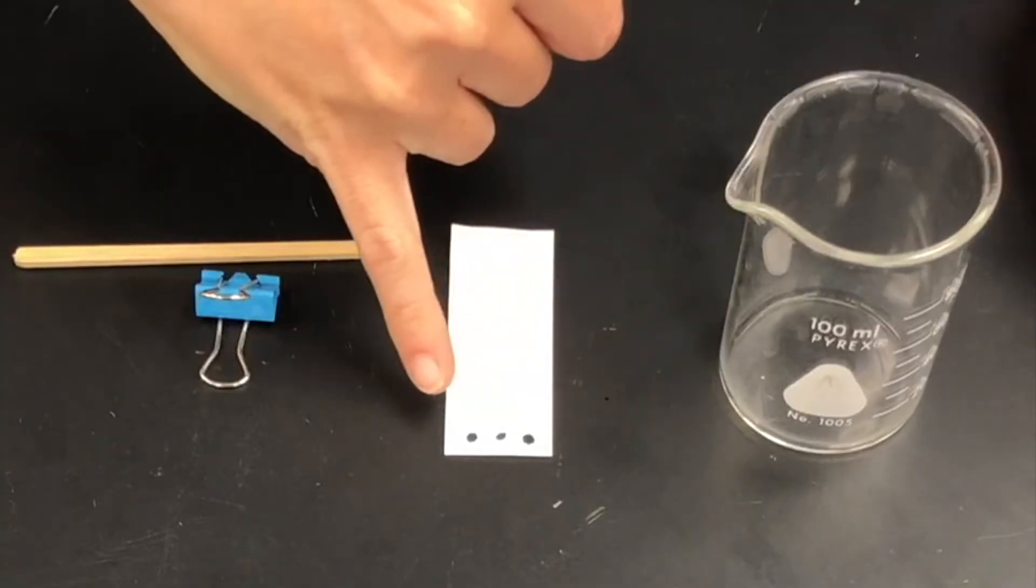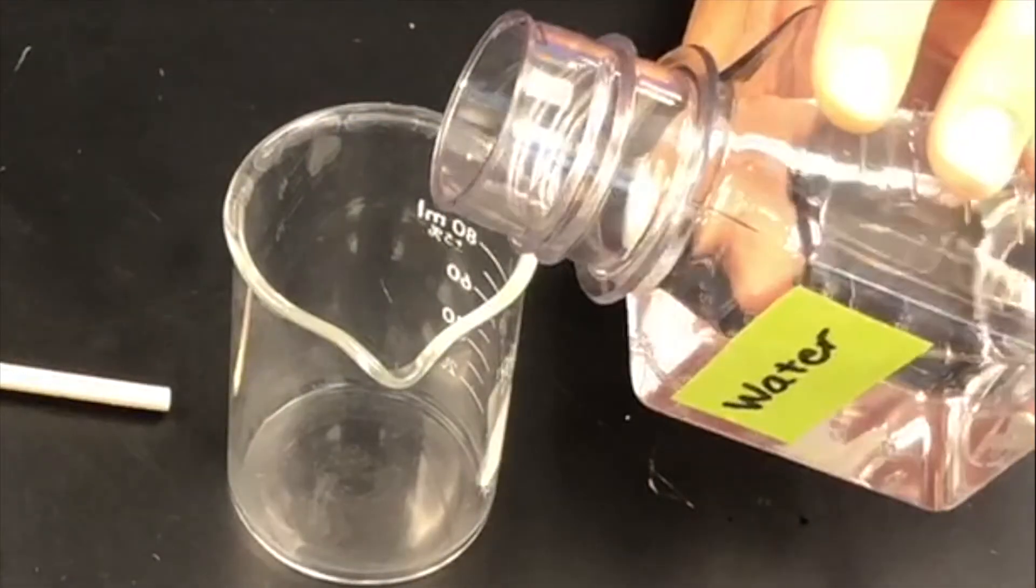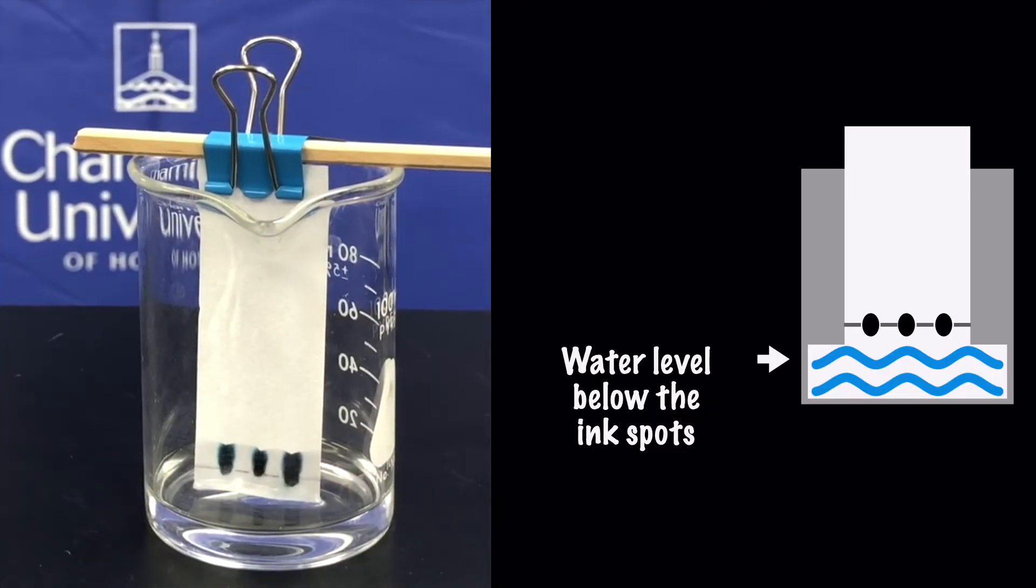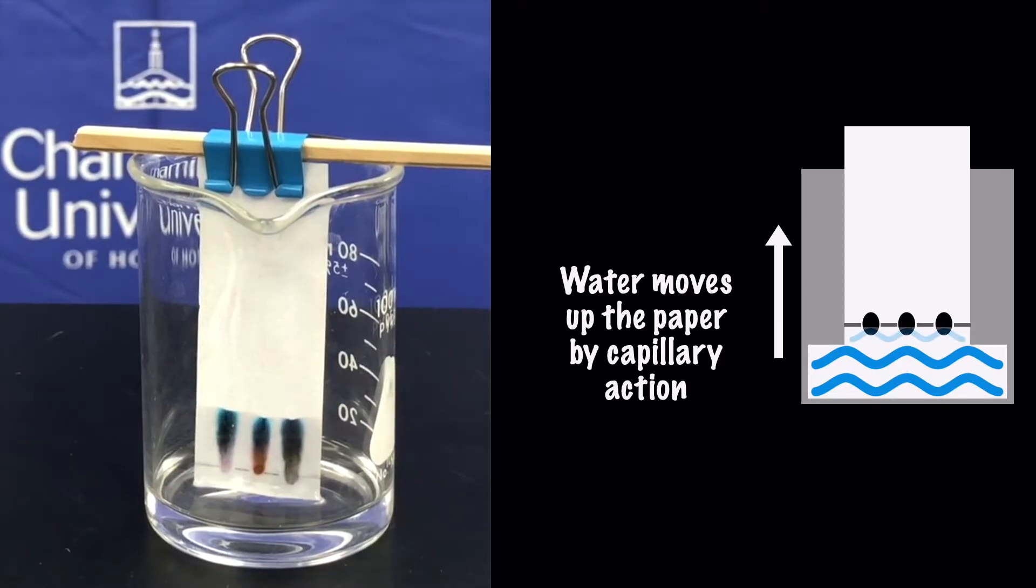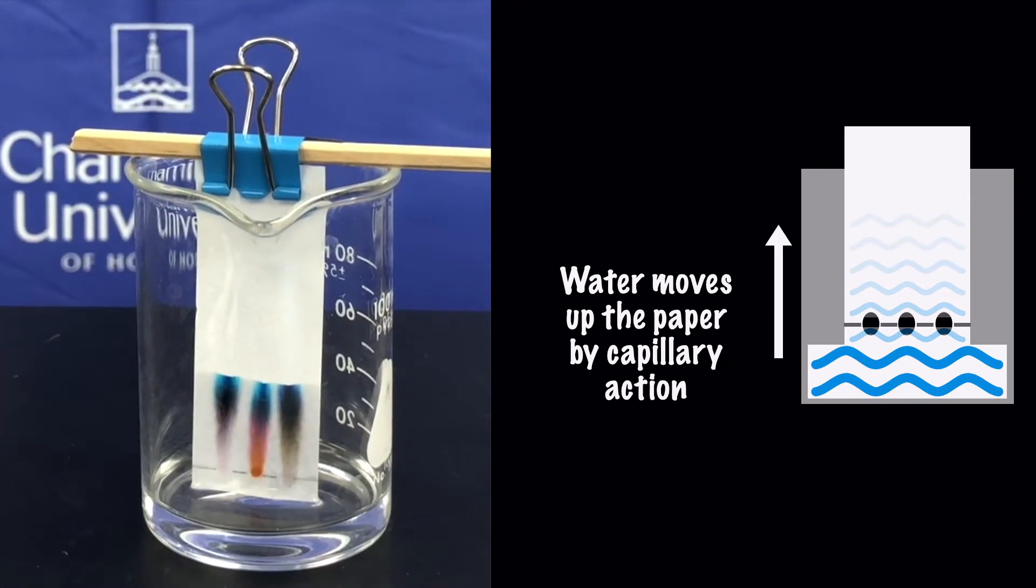Now we have all of our samples spotted along the bottom. Our chromatography paper sits inside of the beaker without touching the bottom. Pour a small amount of water into the bottom of the beaker. We only want it to fill the beaker so that it will be below the level of the spots. The paper is going to absorb some of the water when we place it into the beaker. The water will then start to move up the paper by capillary action.